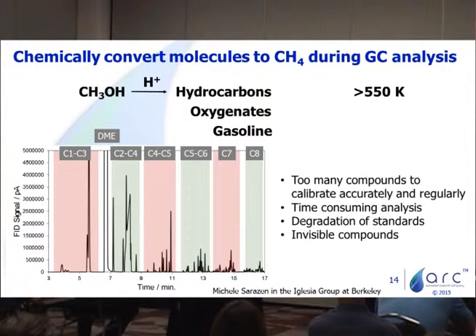So now if we go back to the methanol to gasoline chemistry that haunted me while I was a graduate student, we can ask ourselves what happens to this chromatogram when we react everything in here to methane.